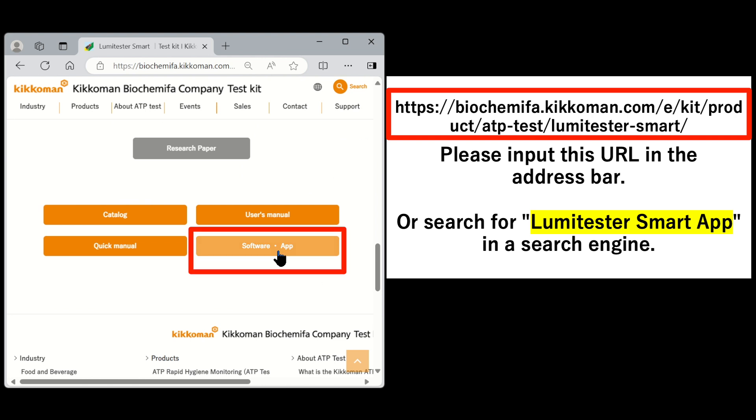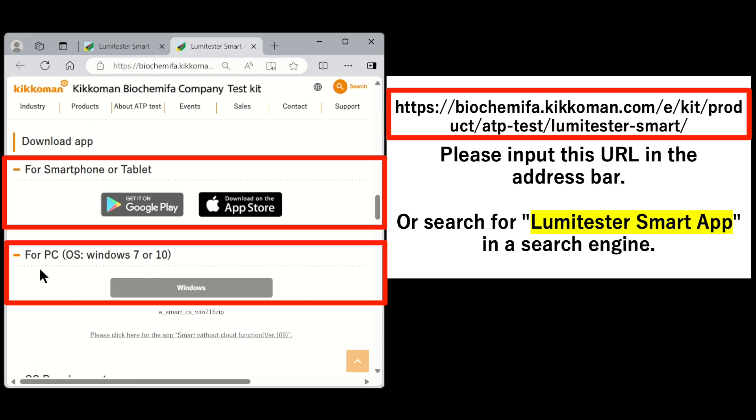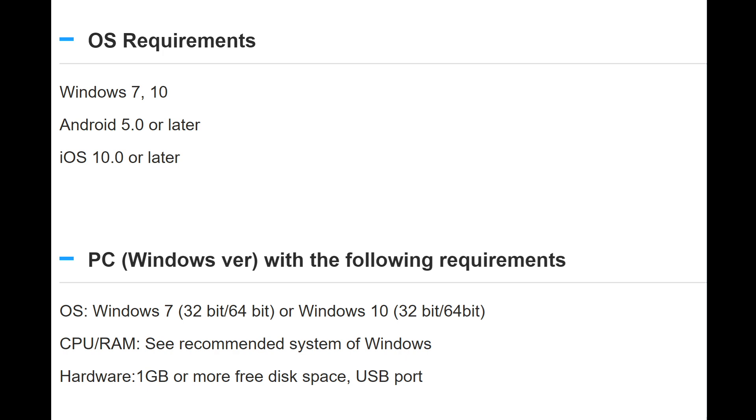There are download buttons for Windows, Android, and iOS. Select the correct version you need to download, and please note that the app may not run properly if the recommended system requirement is incorrect. Please check the recommended system requirements before downloading. Please refer to our website for the operating environment and recommended environment for the app.